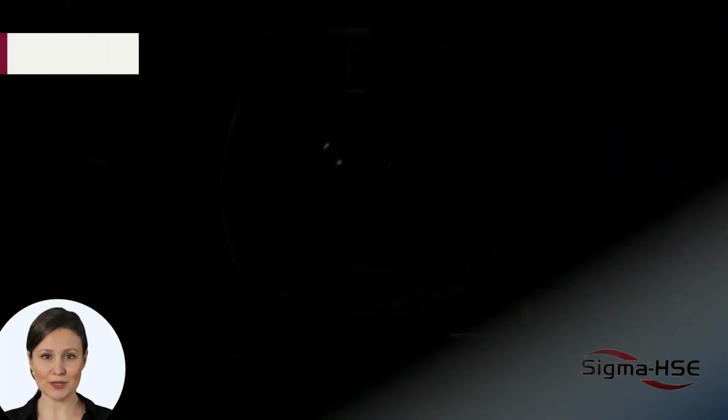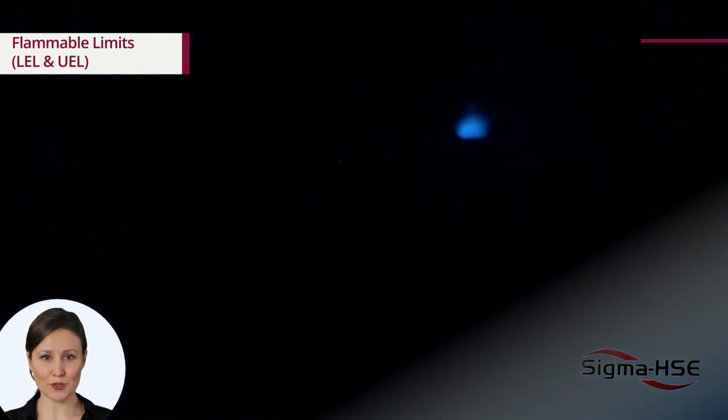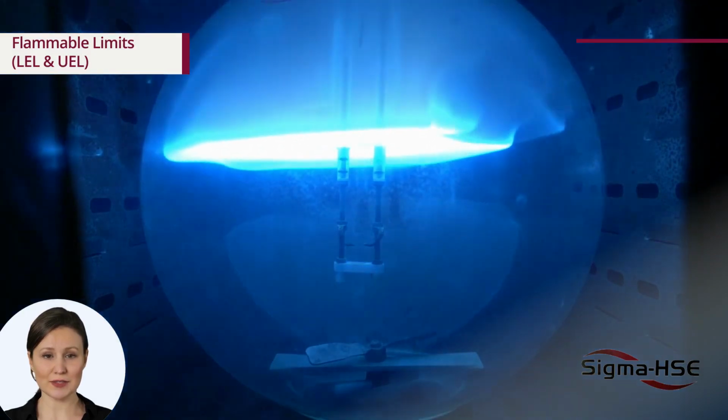Flammable limits, LEL and UEL. This test is conducted to determine the lower and upper flammable concentration limits of chemicals that have sufficient vapor pressure to form flammable mixtures at atmospheric pressures at specific temperatures.